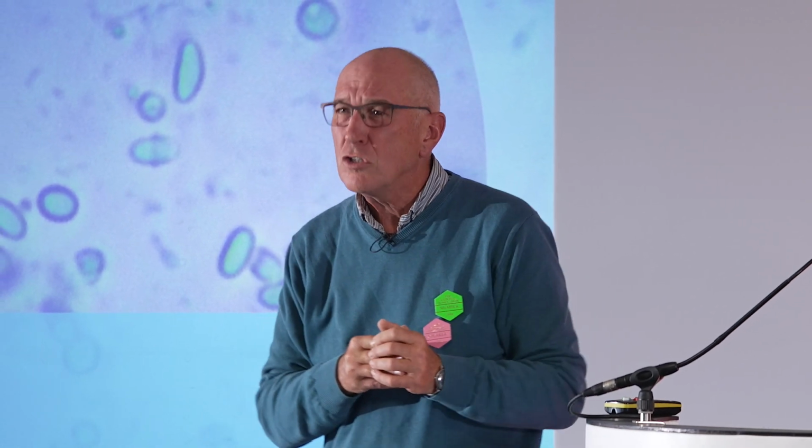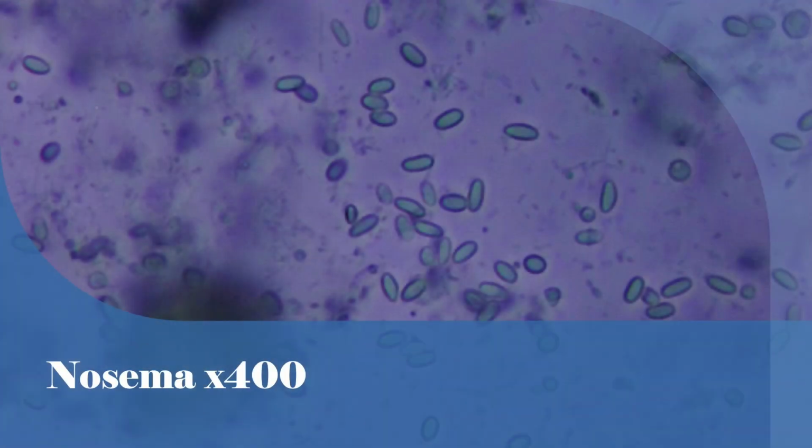But how do you know if you've got Nosema bad or not? Because Nosema is pretty endemic. If you looked hard enough on every bee, you would probably find 1 or 2 little spores. These are spores, like seeds, quite a hard shell.